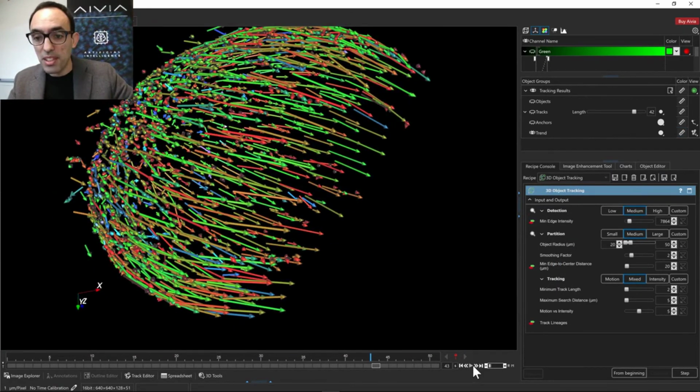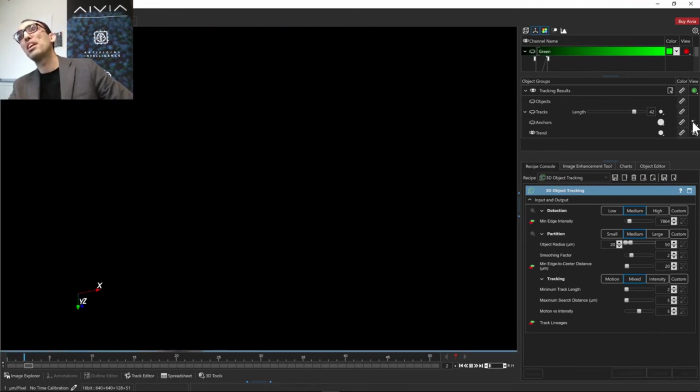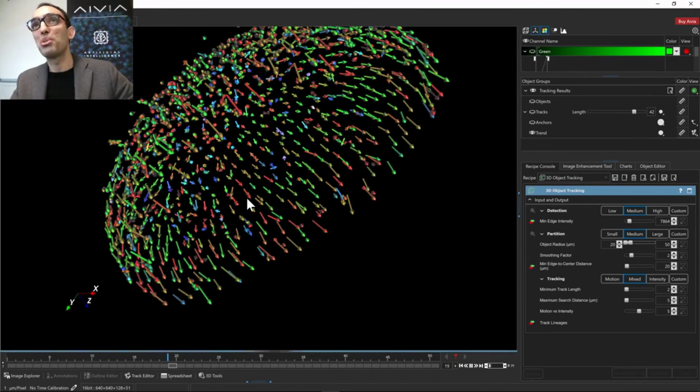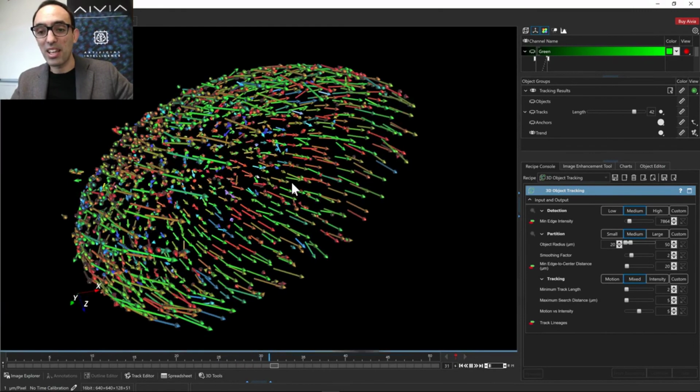And that's it. So these are essentially all the options. You do have a few more that I didn't go through, but for the sake of time, and I'm sure you want to try this anyway on your own, I keep it there.